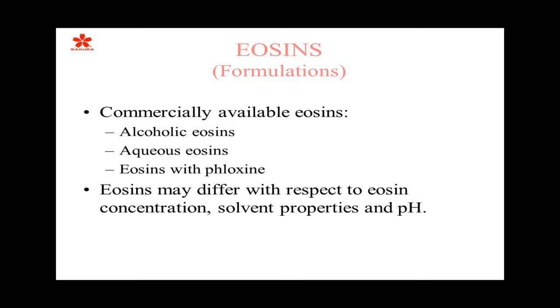In many of the eosins today, the eosins have a much stronger content of alcohol, which gives it a much stronger affinity for the tissues. So in a number of the products that you have out today, I think Sigma is one company, Richard Allen is another company, Leica is another company. They have a higher content of alcohol in the eosins. So in this respect, you could very well eliminate that alcohol that you go into before you go into the eosin.